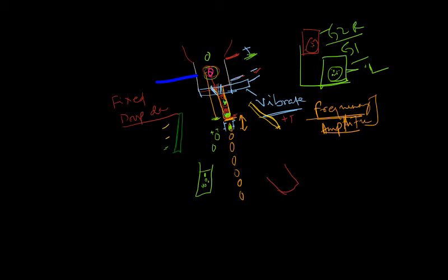Then the opposite charge is applied. Because on the right we have a positive charge plate, when it applies the negative charge, as the cell is breaking off, at that point of time the droplet carries the negative charge. The droplet surrounded by negative charge would deflect towards the right, where there is a positive voltage plate. So this is how it is.